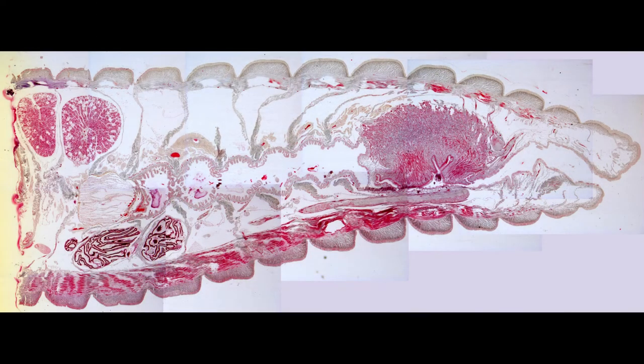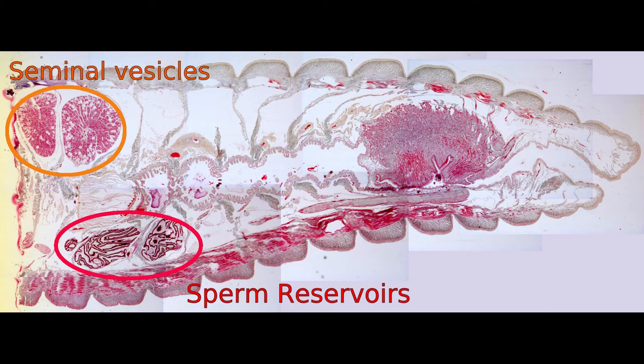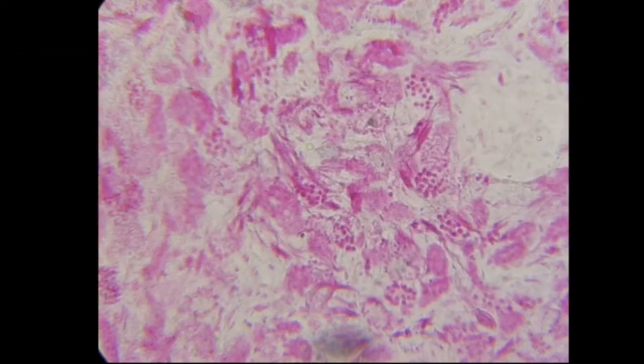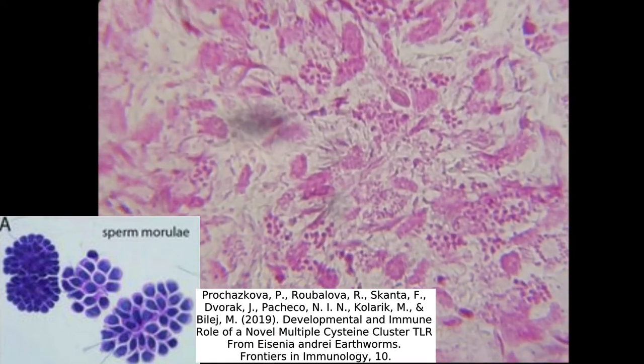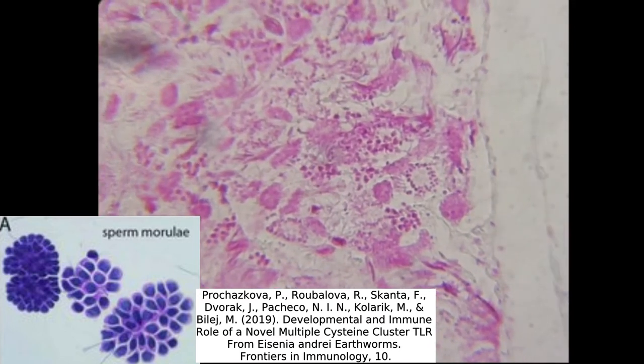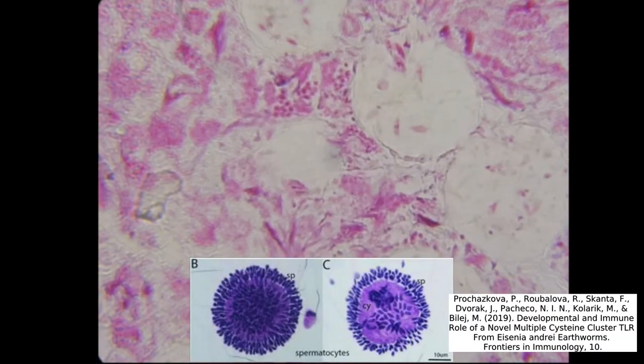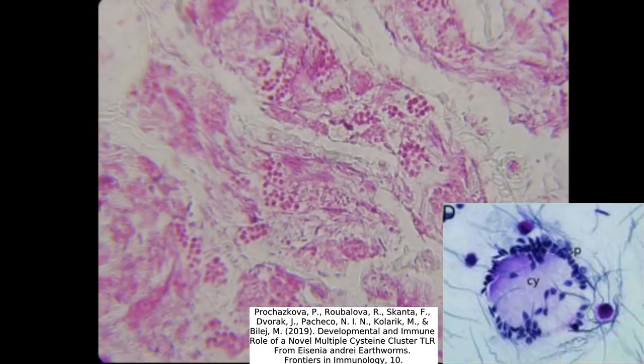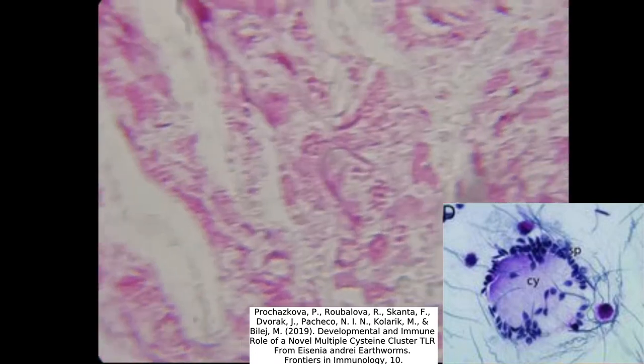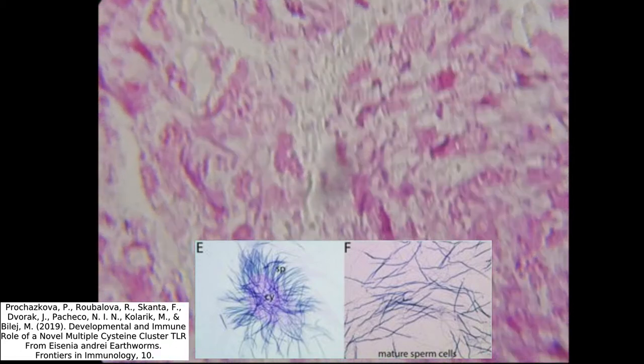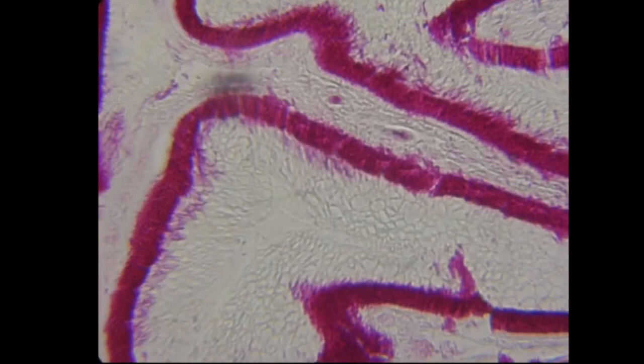Close to the calciferous gland we can find two components of the worm's male reproductive tract: the seminal vesicles and the sperm reservoir. In this section I couldn't find any testes. Unlike in mammals, the testes don't complete maturation of spermatozoa. Within the testes, structures called morulae form. These are groups of cells which have undergone meiosis, or two rounds of cell division, which results in four sister cells with half a set of chromosomes each. These cells share a common central cytoplasm called the cytophore. Once formed, the moruli of spermatocytes travel to the seminal vesicles, where they begin to mature to spermatids with flagella and all the morphological features you would expect a mature sperm cell to have. All of the cells that form a morula are at the same stage of development. Once the sperm are mature, the morula breaks up and the sperm travel to the sperm reservoir where they wait to be released.